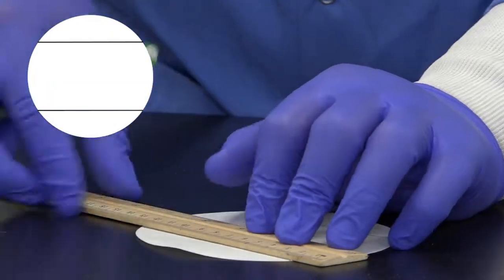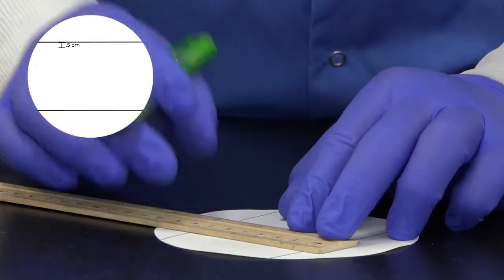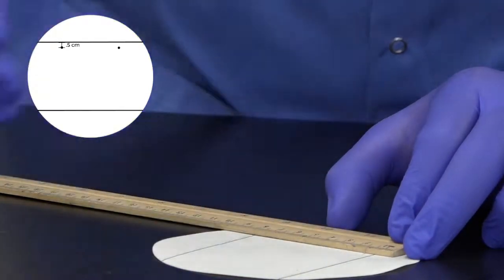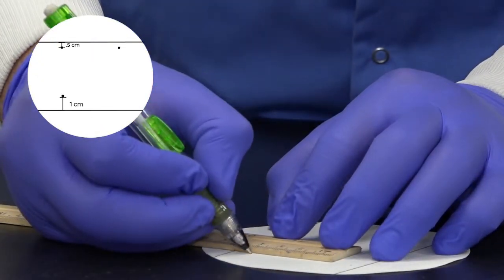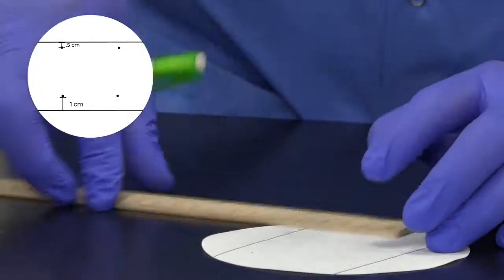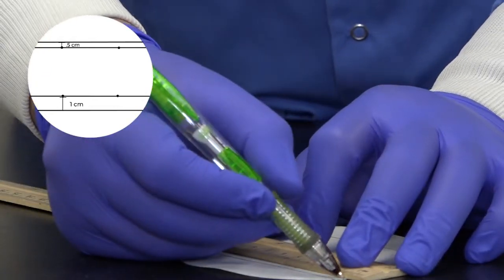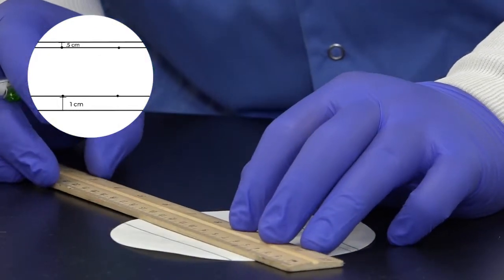Mark a line across. We want to measure at the top 0.5 centimeter from your marking, in 2 different places, so that we can get another straight line. At the bottom, we're going to mark 1 centimeter from the line to the top. 1 centimeter and 1 centimeter. We're going to connect our dots and make another straight line. The line at the bottom, the one that's 1 centimeter from the lower marking, is where we will introduce our sample.